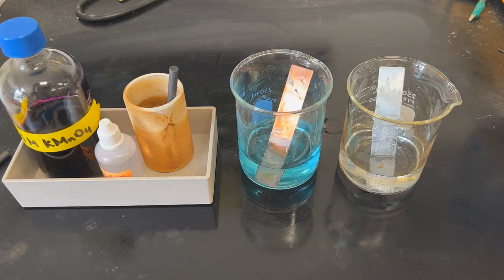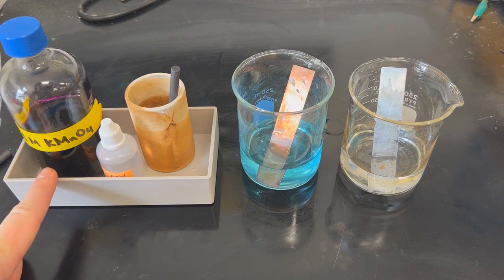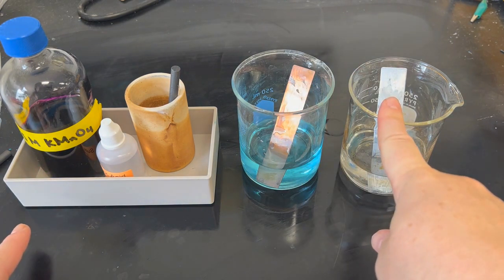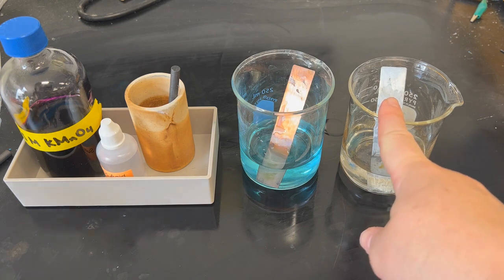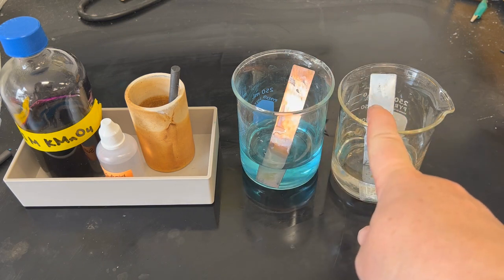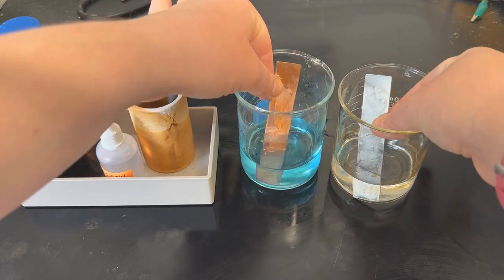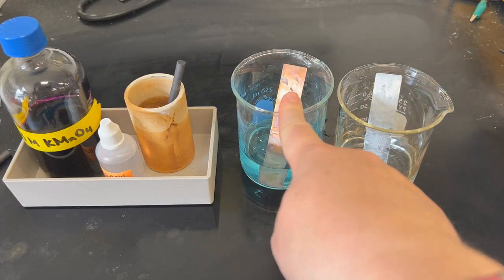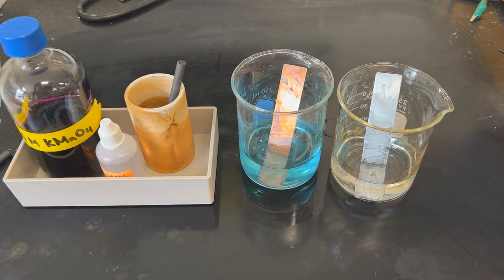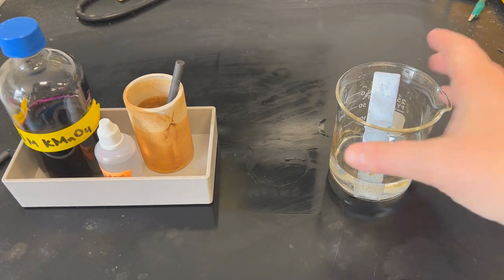Which cell we choose to keep really depends upon our special chemical here. Potassium permanganate is a very strong electron acceptor. Therefore, we're going to choose the half cell from our original battery that is a good donor. Recall that in the original battery, copper ions stole from zinc metal. That means that in comparison between the two, zinc and copper, zinc is a much better donor than copper. It's much more stable in its ion form than copper is in its ion form. Therefore, we're going to keep the zinc cell and replace the copper one.